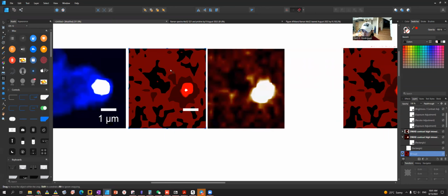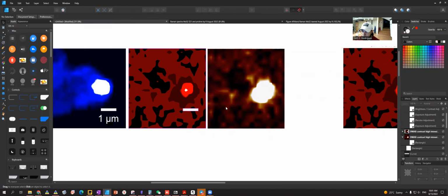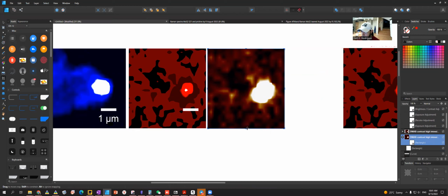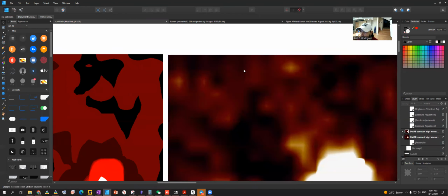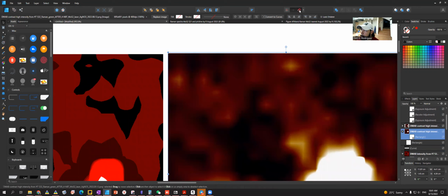What you need to do is then ungroup this in this figure, so you can serve as a guide. Now it's using it as a guide. But I'm not sure. You can see this one is a bit higher. Yes, that was the mistake I made.